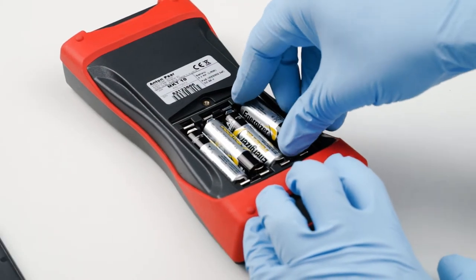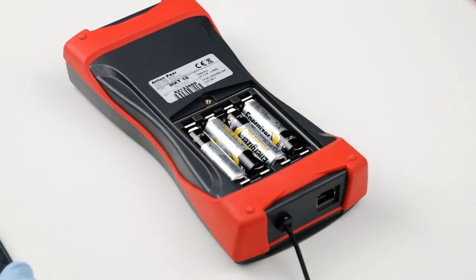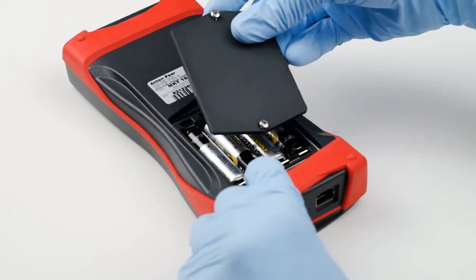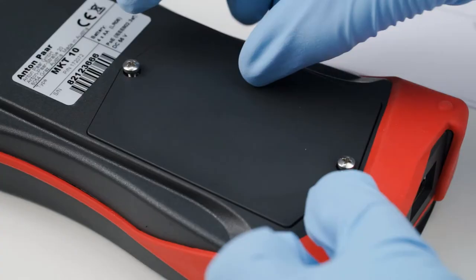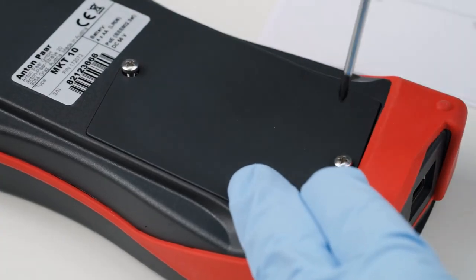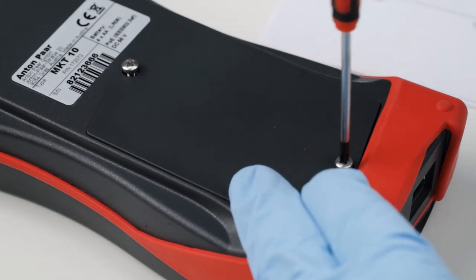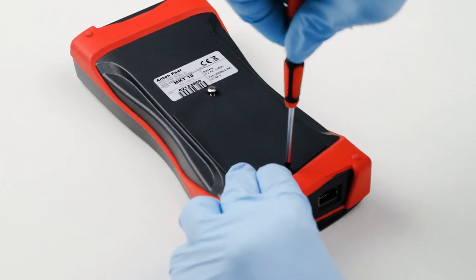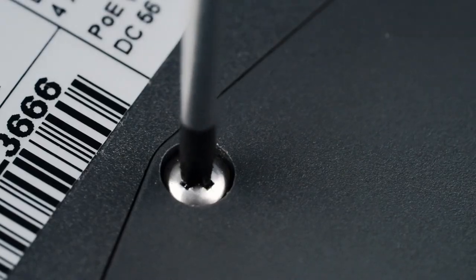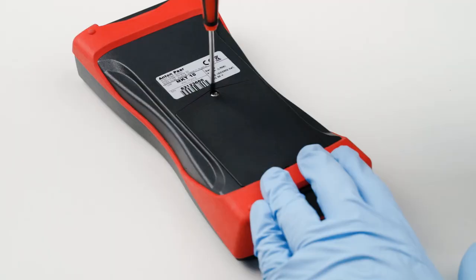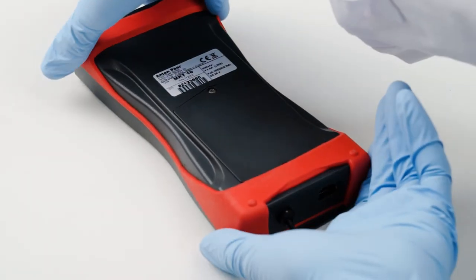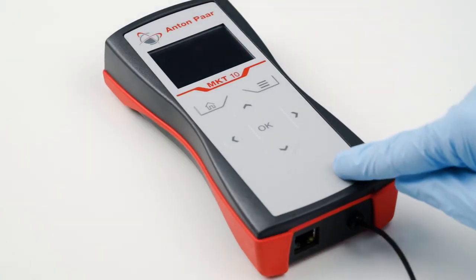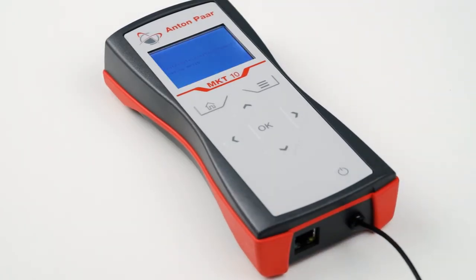Close the battery compartment and screw in the two screws. Switch on the MKT-10 by pressing the button on the front of the device.